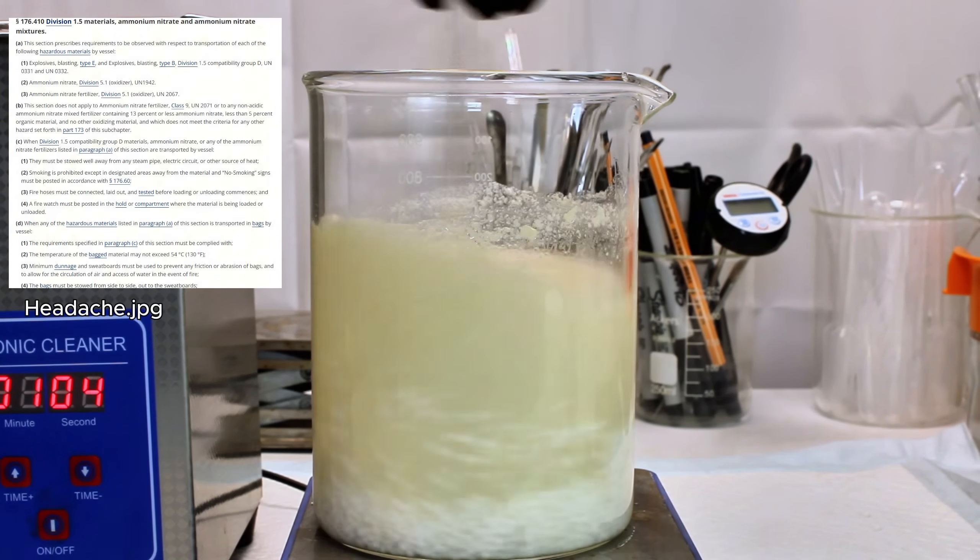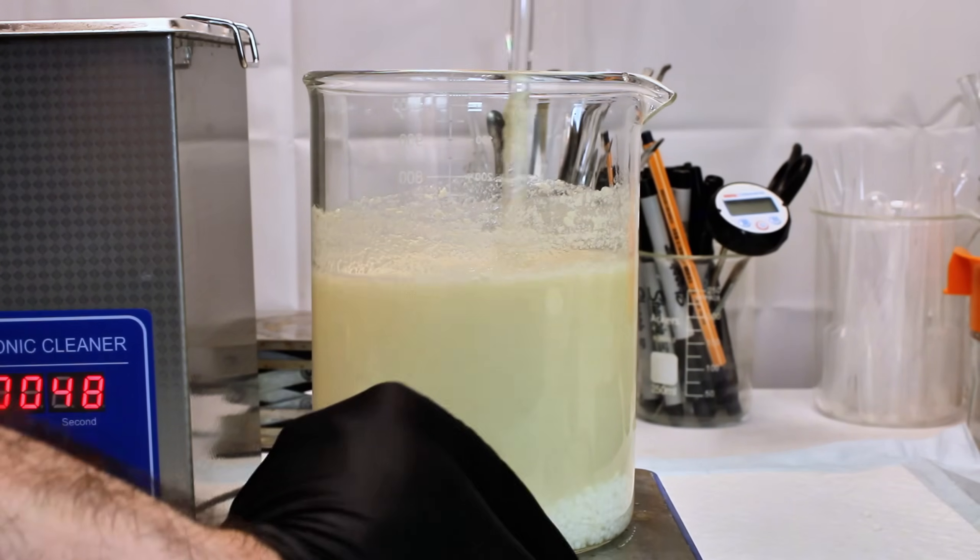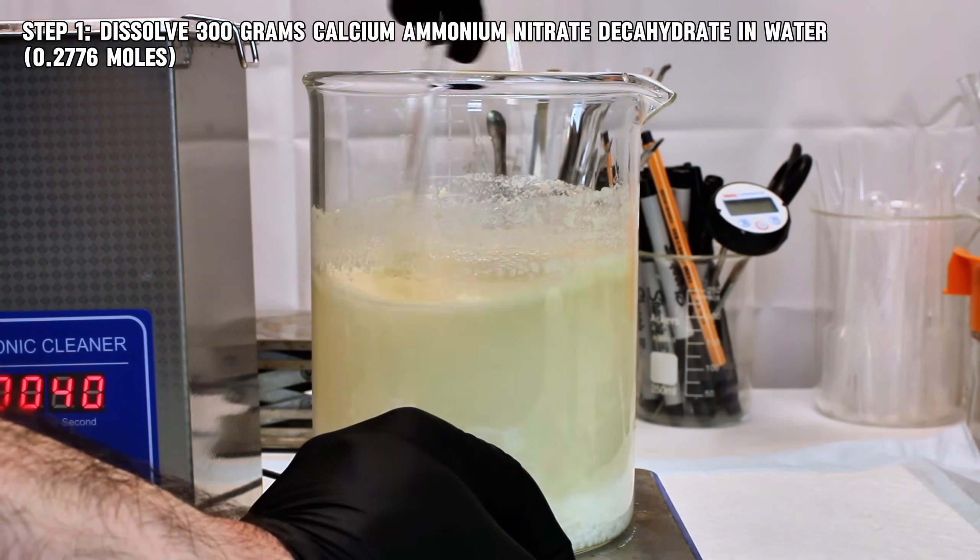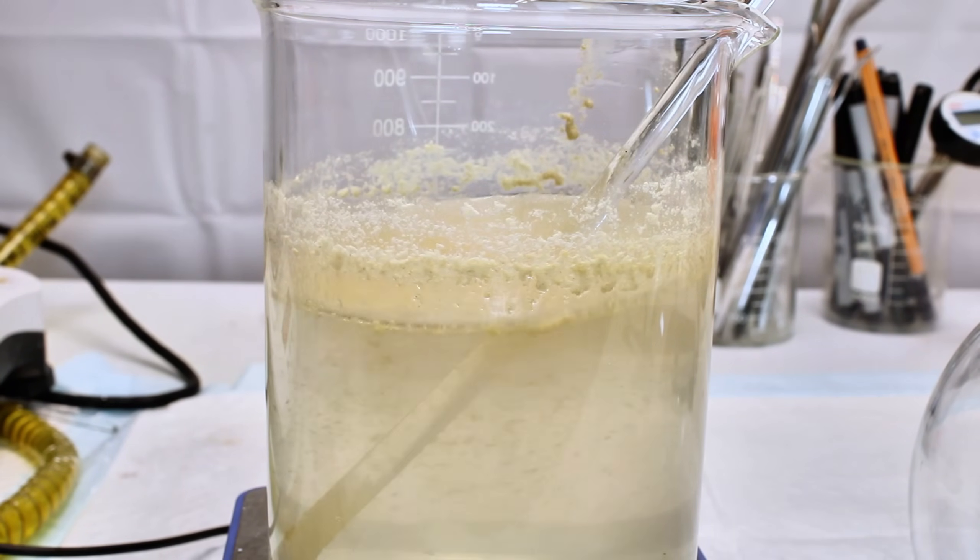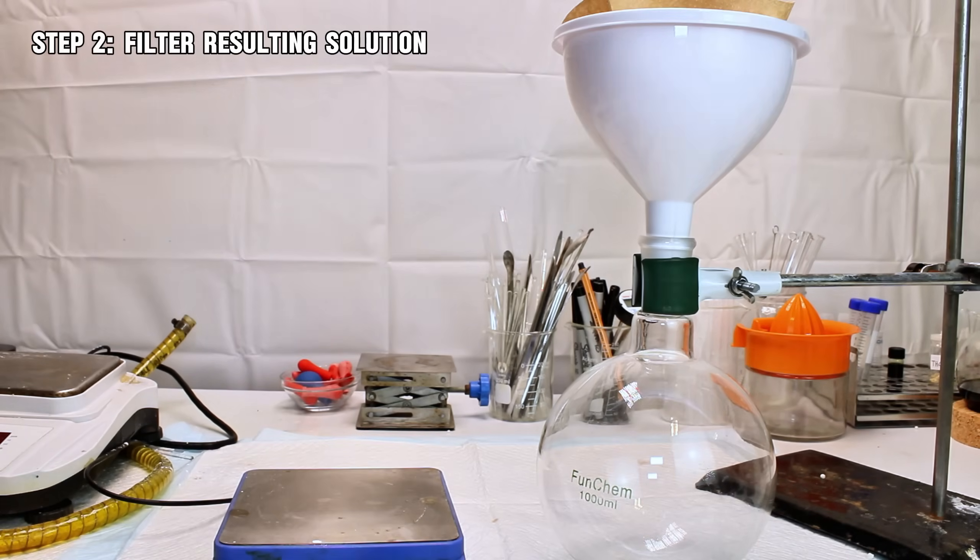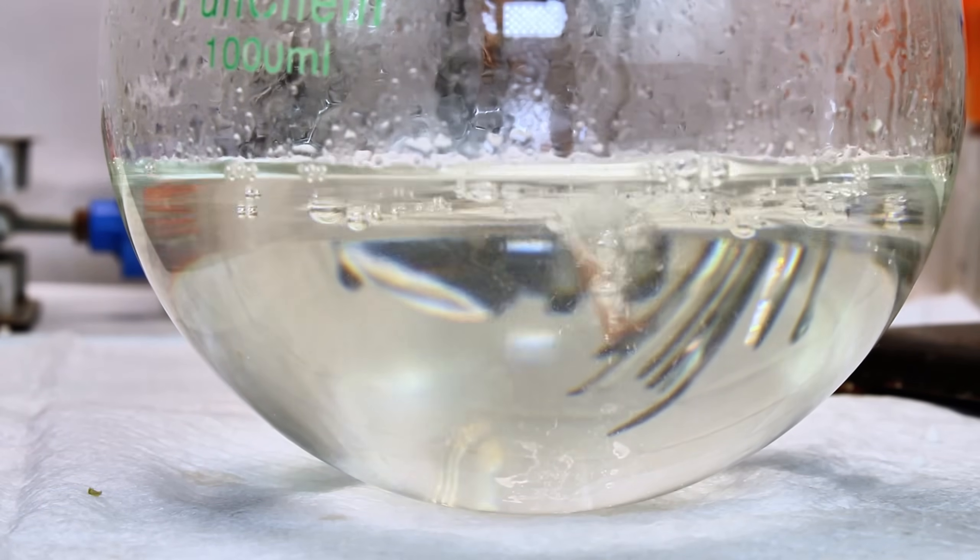In any case, to make calcium ammonium nitrate into calcium nitrate, the first thing I did was to weigh out about 300 grams and dissolve it in some distilled water. Once the calcium ammonium nitrate had totally dissolved, a bunch of this disgusting oily brown crap floated to the top, which I was able to remove by passing it through a coffee filter.